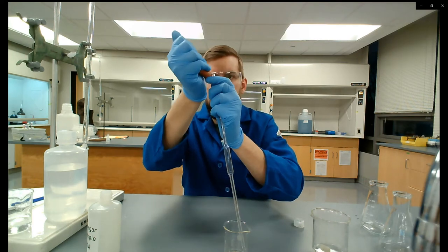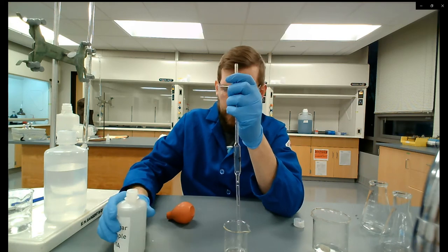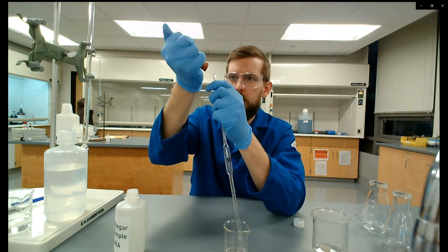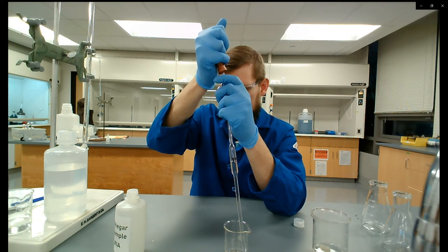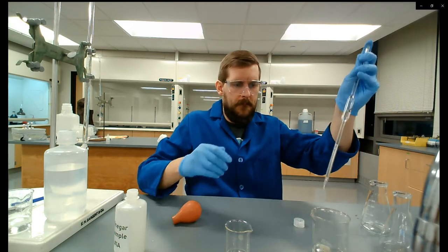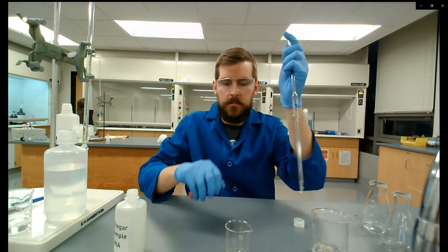I'm not using the pipette to measure here — just pulling liquid up. I started pulling air bubbles through so I'm getting more vinegar. That's probably about enough. Tilt the pipette and let the vinegar go throughout it, coating all the walls, and then force it all out again.